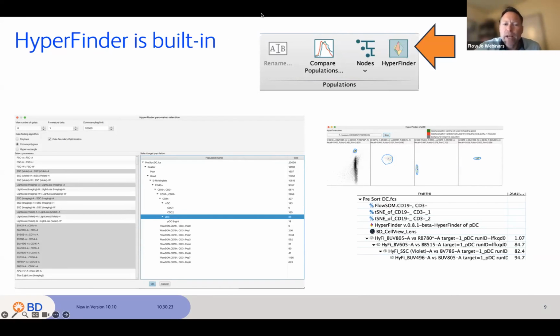I see something in Q&A, I think. There's a question in the Q&A, what kind of files do we need to bring in for spectral data? Only unmixed data files? It is up to you. Spectral data files can be exported either as already unmixed, and then you can just use them in FlowJo, or you could bring in the raw data and you can unmix them in FlowJo. Your call. I think most of the personal preference aspects of that are like, where do you want to bother to type in the names of parameters and so forth? So really personal preference, but we can unmix or just handle already unmixed data as well.